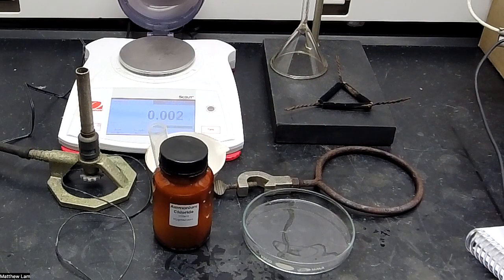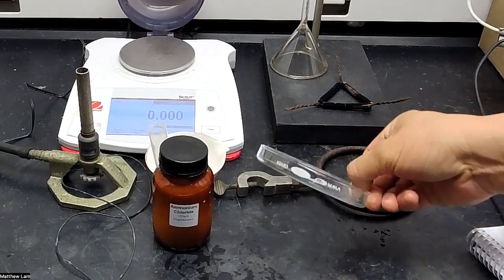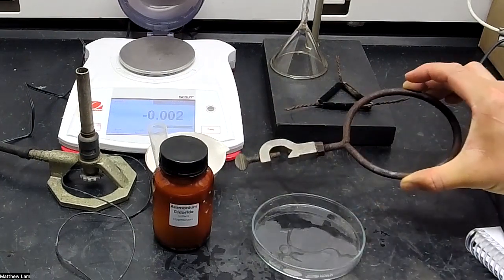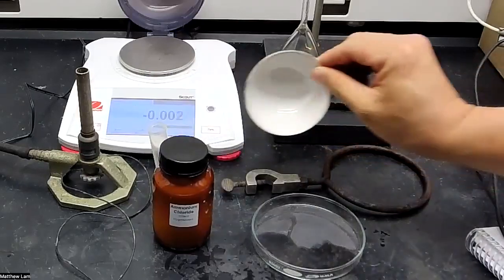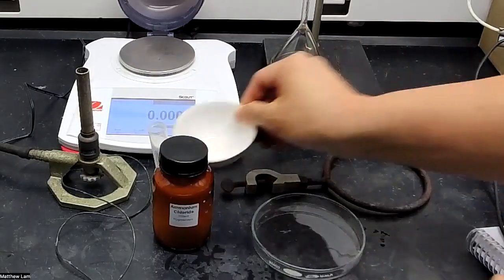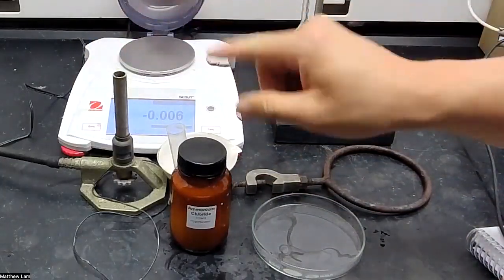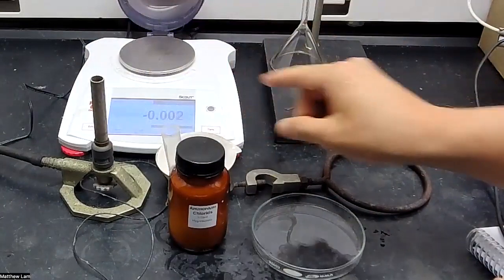Let's go over our general materials before we start the experiment. We have a petri dish or one side of it, a ring clamp, a porcelain evaporating dish, ammonium chloride, a Bunsen burner which I'm going to show you how to use in just a second, and a balance.